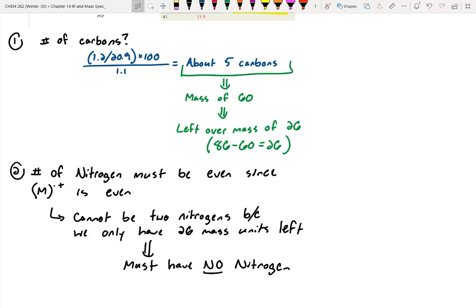All right, so let's try to figure out what else could likely be in an organic molecule. What other elements might show up in an organic molecule? Oxygen or hydrogen, right? Those are the most common ones we're running into. Which one do we want to try first? Let's try hydrogen. Would it be possible to have 5 carbons with 26 hydrogens on them? It would be impossible.